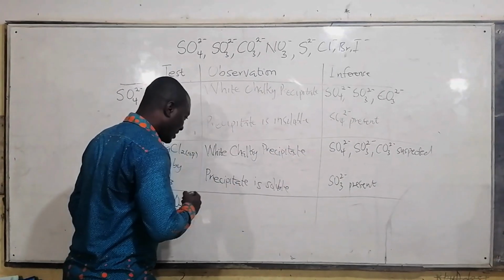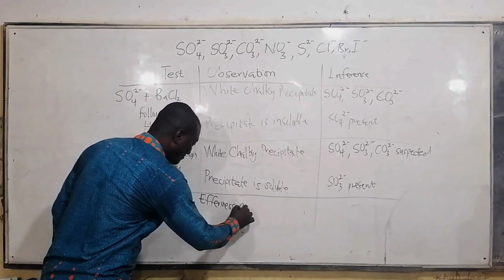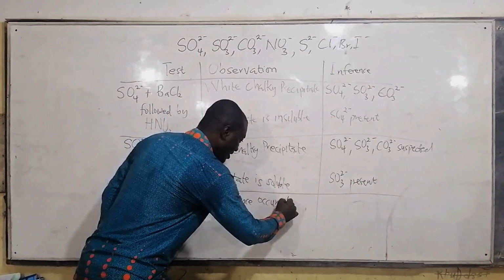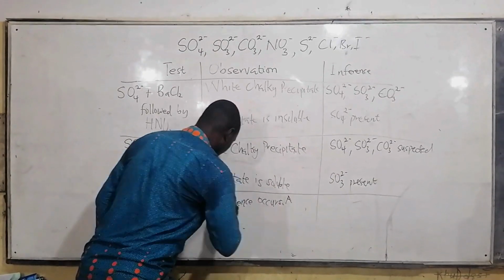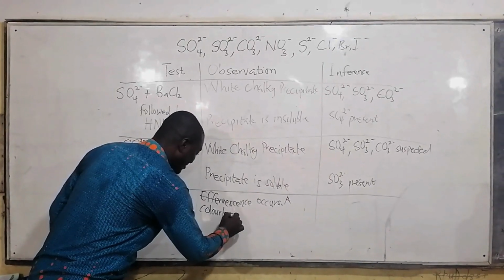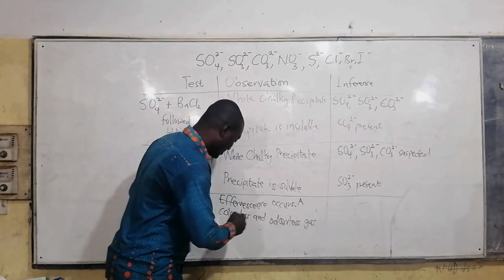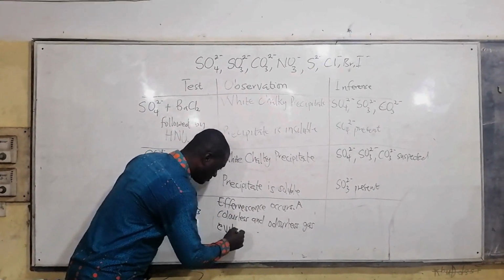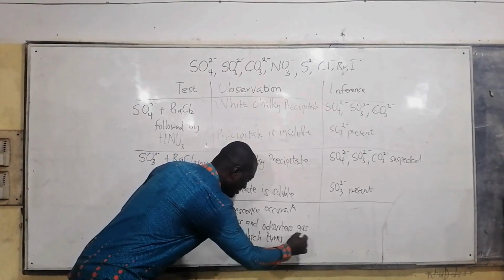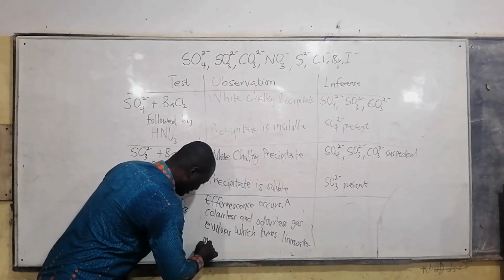So what we write here is effervescence occurs. Colorless and odorless gas evolves, which turns lime water milky.